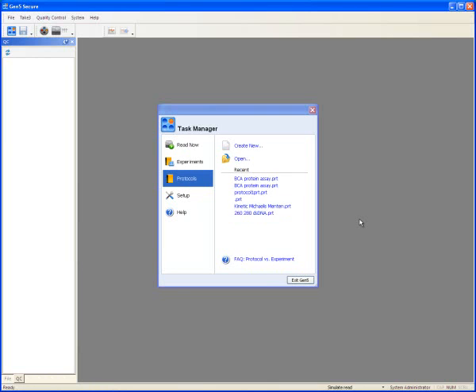This video briefly illustrates how the QC trending module works in Gen5 2.0. First of all, in Gen5 2.0, the QC trending module is included with Gen5 Secure. So if a user is interested in the QC trending module, they need to purchase Gen5 Secure.